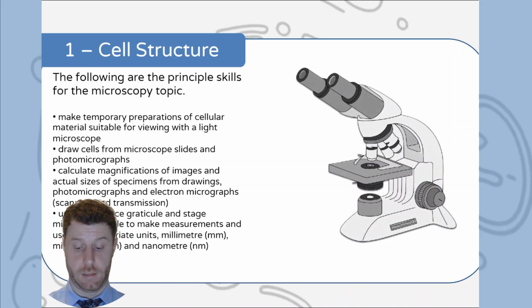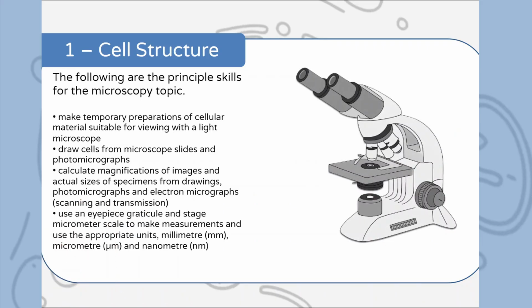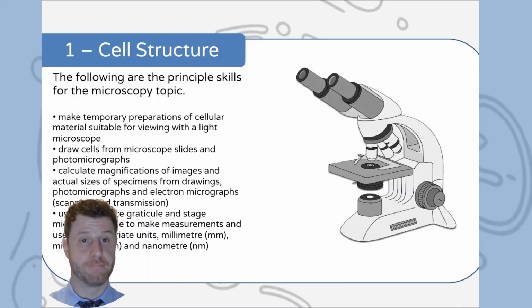And these are the exact specification points given from Cambridge for this practical. All right guys, so let's make a start.